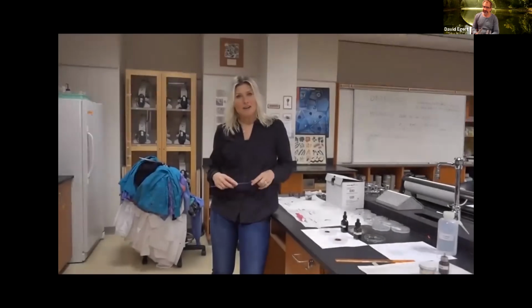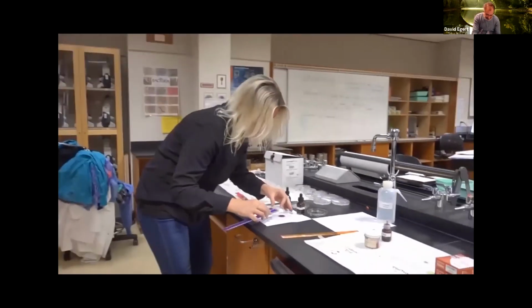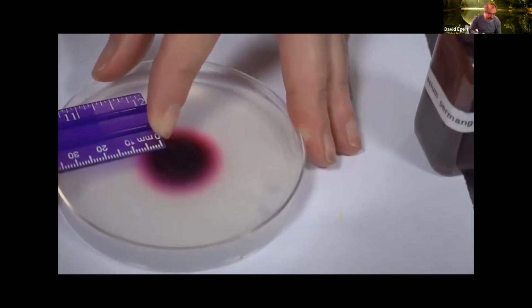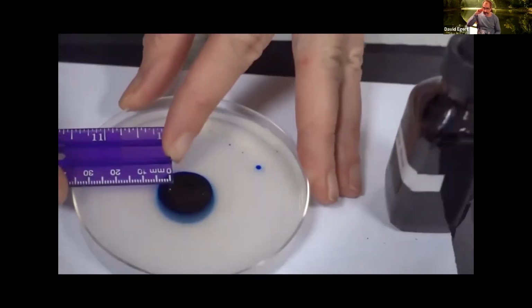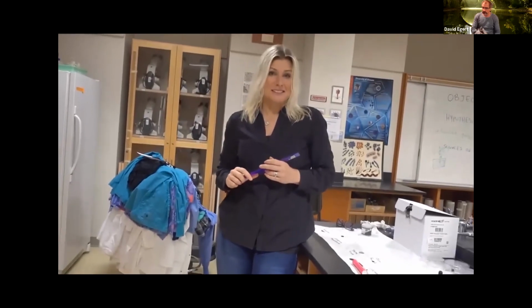Back here for our last diffusion measurement. And so when we take a look at the potassium permanganate, it looks like only 7.5. And for our methylene blue, 4.5. So definitely it looks like the rate of diffusion is slowing down, but it's for you to calculate exactly what that rate is.